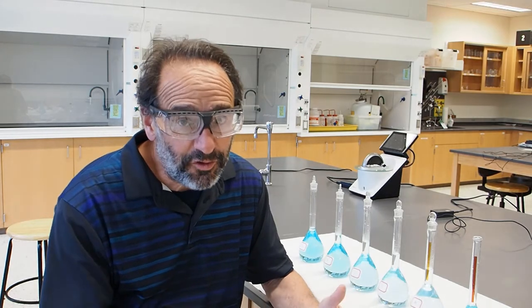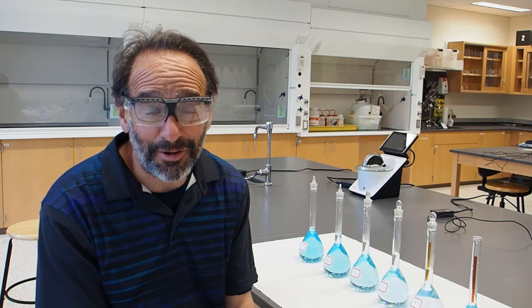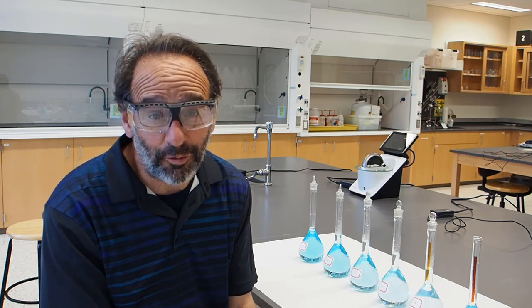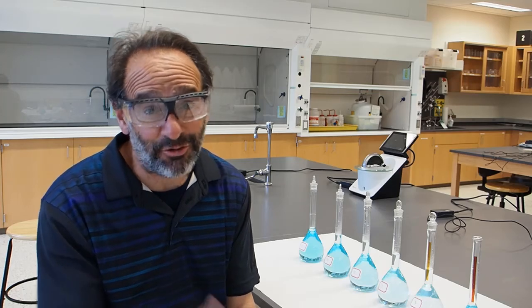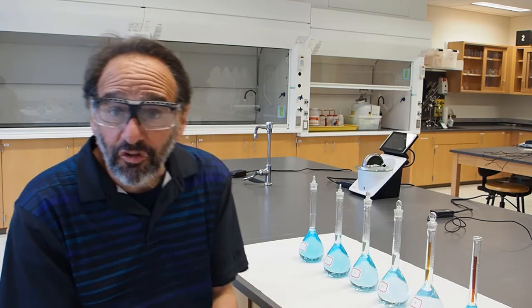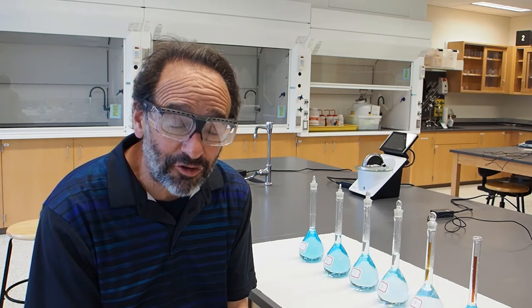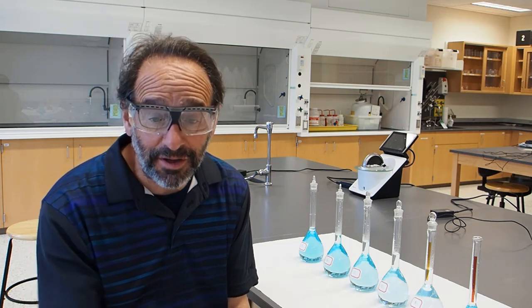Class, the visible portion of the electromagnetic spectrum goes from 400 nanometers to 700 nanometers, and we just made our final measurements at 810 nanometers. The title of this experiment is UV visible absorption spectroscopy, and it is not lost upon me that your final measurements are made outside of those regions of the electromagnetic spectrum. But so be it. So your final task is to take the data that we just measured and use that to figure out the identity of the copper compound that we were measuring, and that will be explained next.